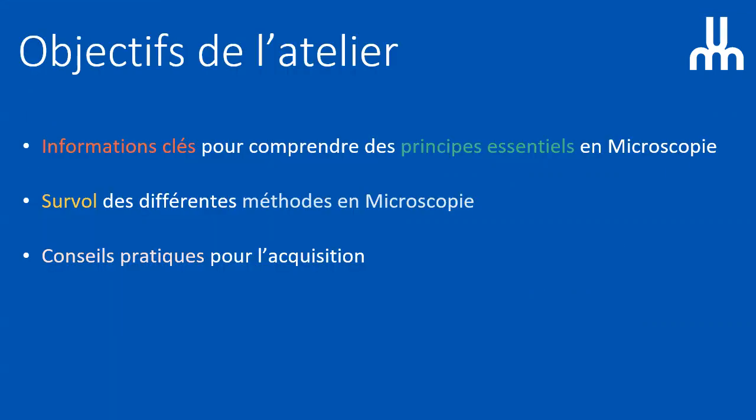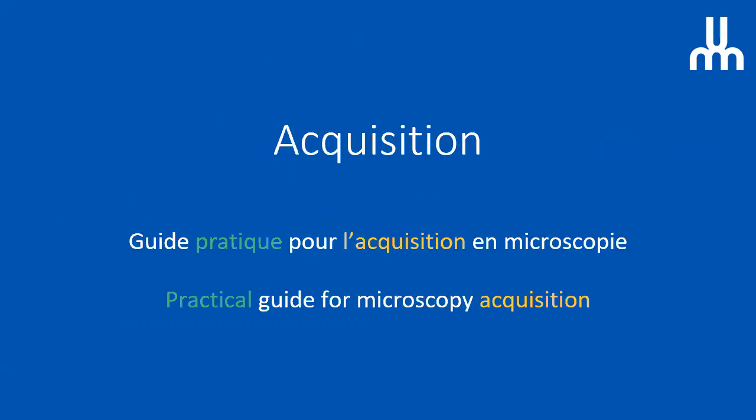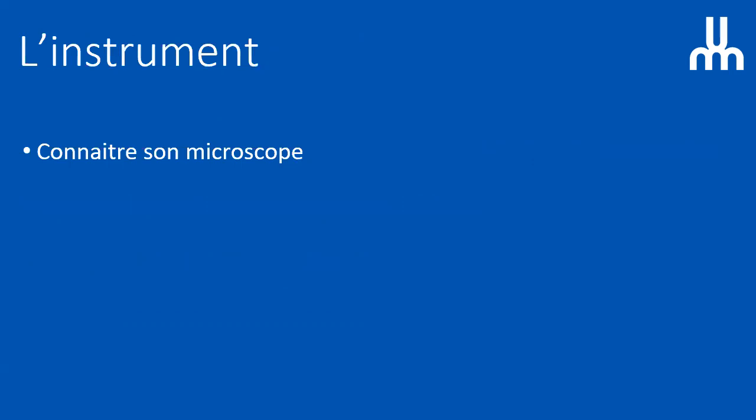The last part is about acquisition and really the tips that help you, a practical guide for acquiring images. The first thing I want you to know is you need to know about your microscope. And if you don't know which microscope to use, come to us. We know, and we will help you find the best tool you need.